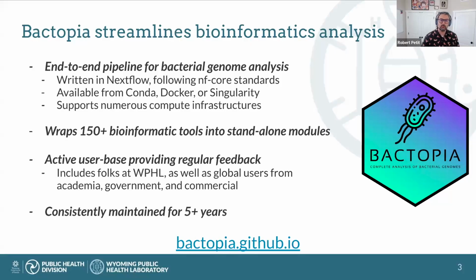Bactopia is an end-to-end pipeline for the analysis of bacterial genomes. It's written in Nextflow. It follows nf-core standards. It's available from Conda, Docker, or Singularity, and it supports numerous compute infrastructures. If you've used Nextflow, anything that Nextflow supports to be executed on, that could be your laptop, desktop, servers, HPC systems, the cloud systems, Bactopia also supports it.